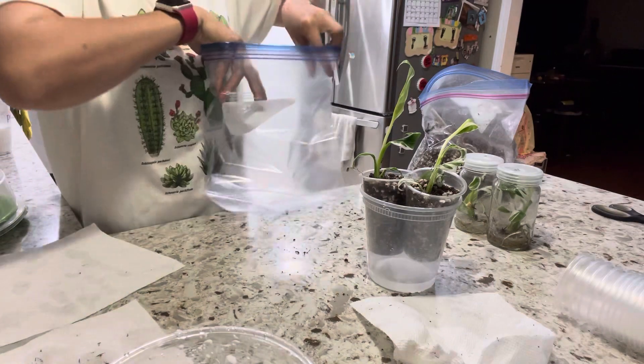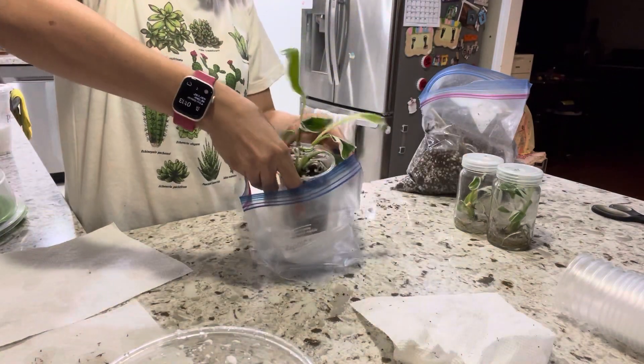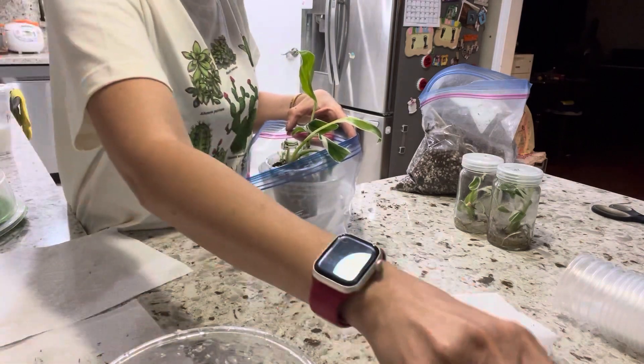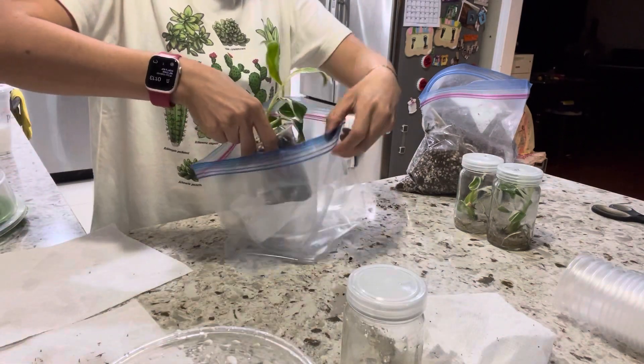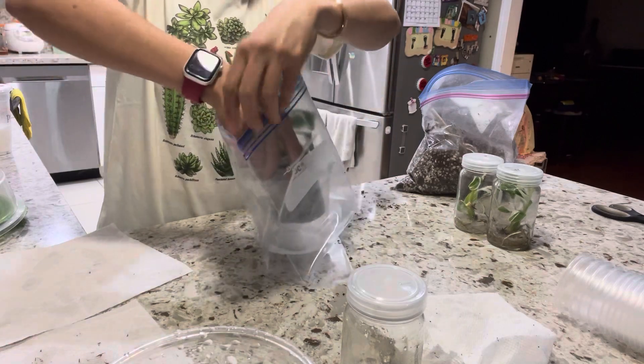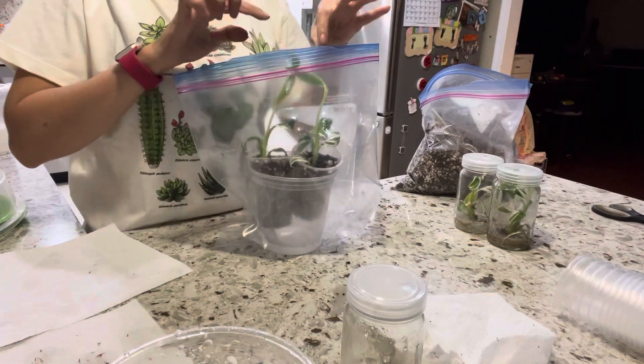What I'm trying to do is create humidity. It was in the flask with a lot of humidity — almost 100% — so you're trying to mimic that same greenhouse environment.